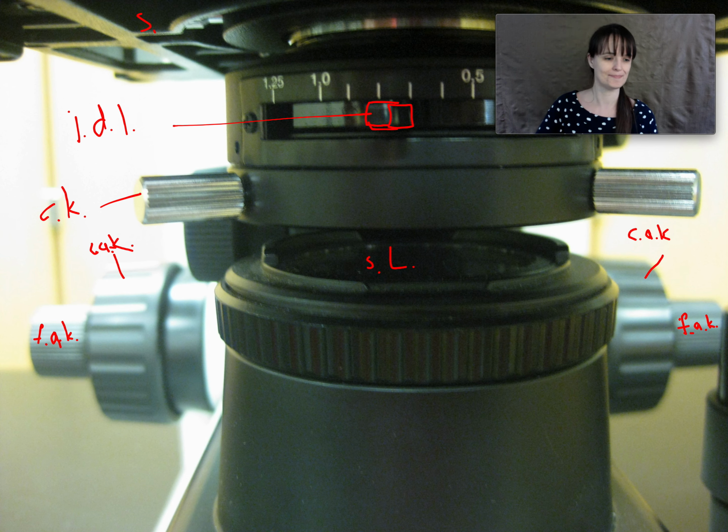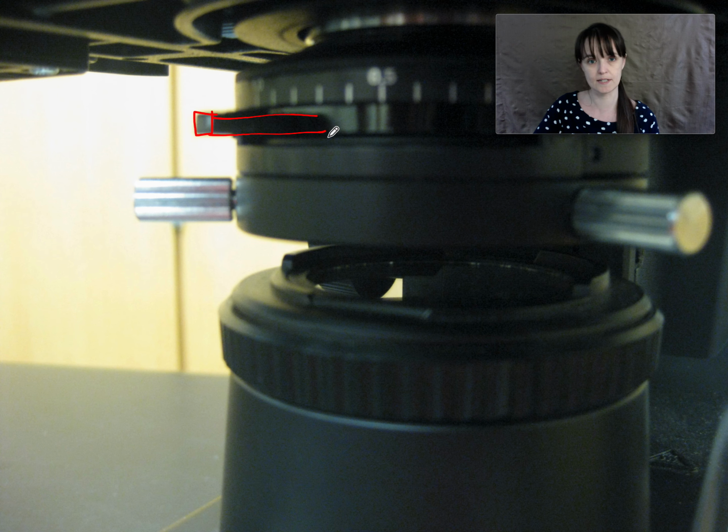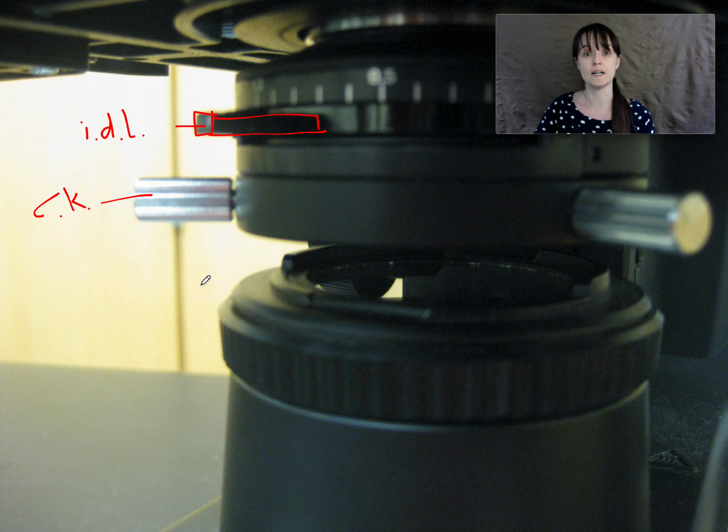Okay. Next slide. That's the same thing. Okay, so here you can actually see the iris diaphragm lever because it's to the side instead of coming straight out at you. Iris diaphragm lever. And still a condenser knob. Knob is an N with a K. Excuse me, this is still the substage light. Okay.